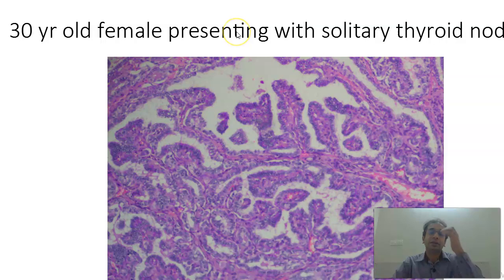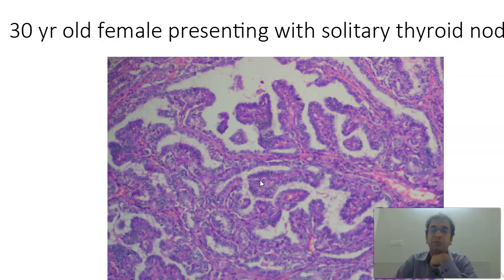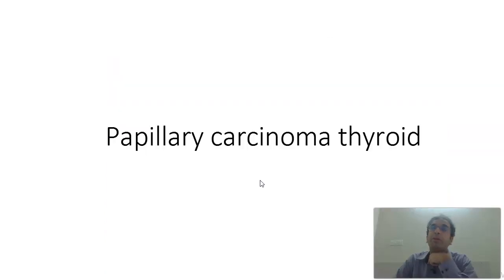Next, a 30-year-old female with a solitary thyroid nodule. What you find here is papillary configuration, Orphan Annie eye nuclei which are the optically clear nuclei, and fibrovascular cores — papillary finger-like projections are very obvious. The nuclei have Orphan Annie eye nuclei. These are the points to identify papillary carcinoma of the thyroid. It is very common in females and the first presentation can be an enlarged lymph node in the neck, called lateral aberrant thyroid.